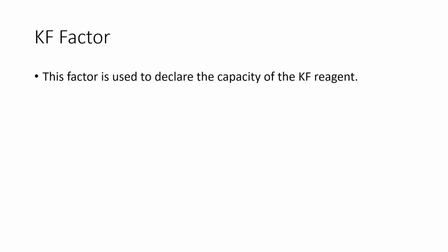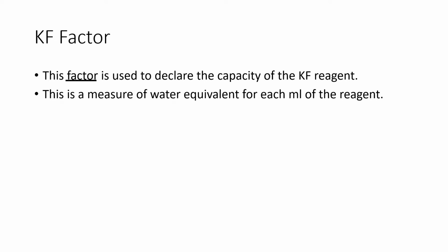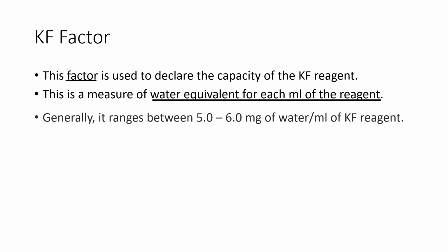Let us try to understand what a Karl Fischer reagent factor is. This factor is used to declare the capacity of the Karl Fischer reagent. This is a measure of water equivalent for each ml of the reagent.